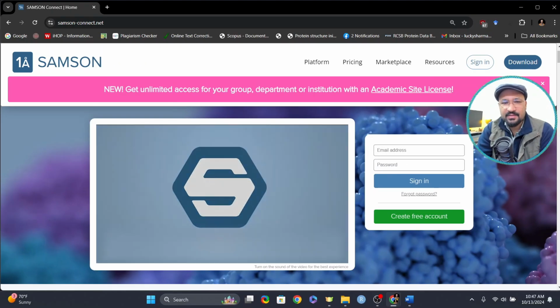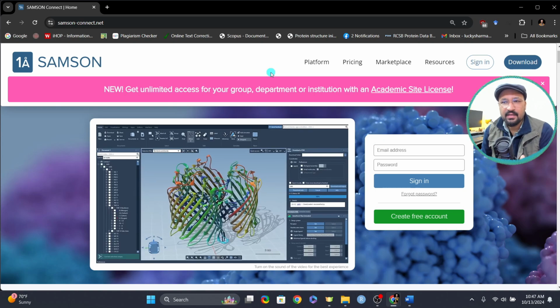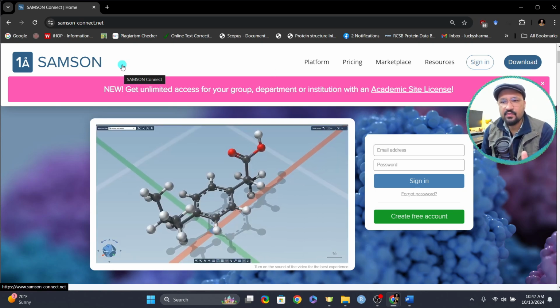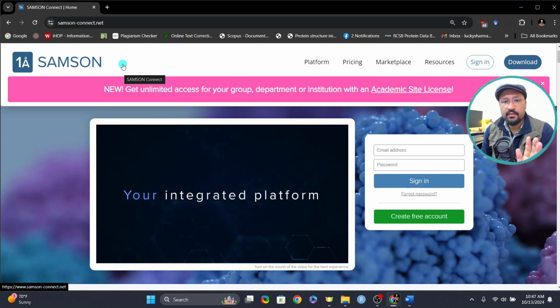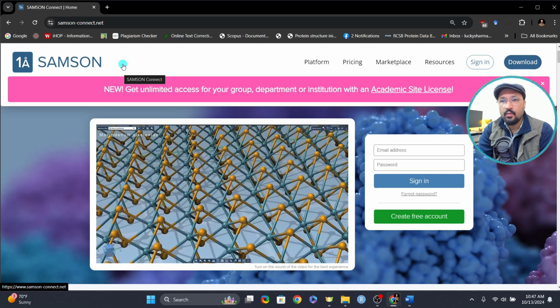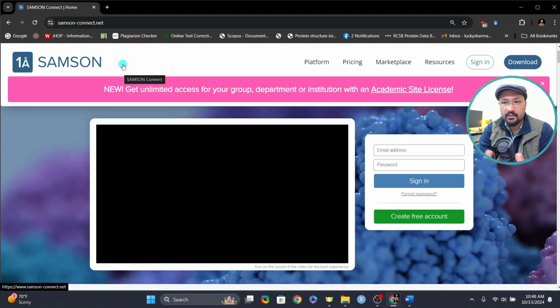Hello everyone, welcome to today's video. Today we will be understanding an important tool that I've been using recently, which is SAMSON. What is SAMSON? In this video we'll try to understand that. What are the different features that are available for you through SAMSON? What you can do with SAMSON if you're a biologist, a computer scientist, a chemist or a physicist.